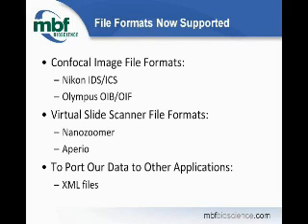To make it easier to port our data into other applications, we're now able in version 10 to read and write XML files. So our tracing data can be parsed much easier by going to XML. It makes it much more portable to go into applications like MATLAB or into other programming languages like Java or C++.